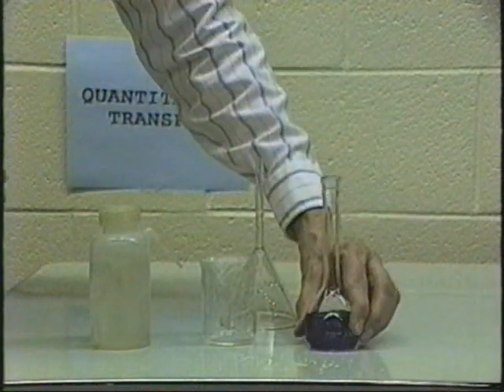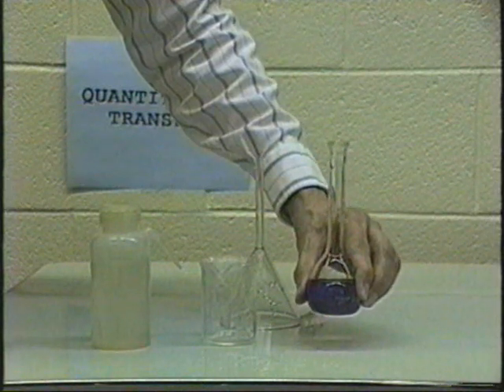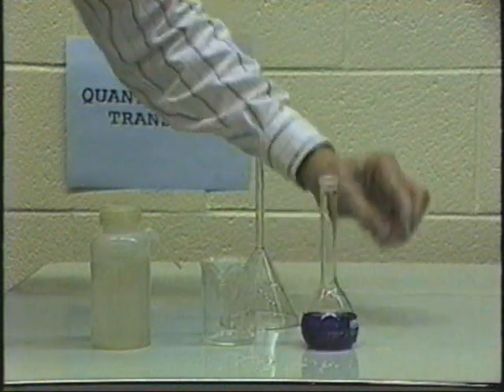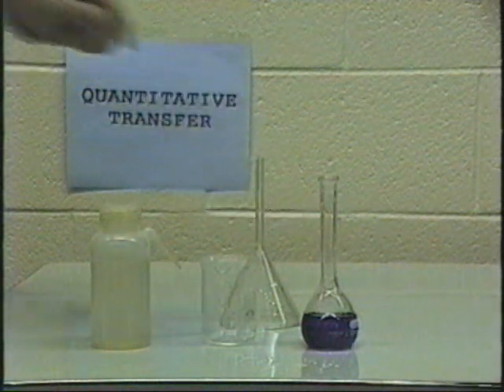At this point, check to see whether or not the solution is at room temperature. If it's not at room temperature, you can cool it in some cold running water. But at this point, then you're ready to fill this up to the mark.